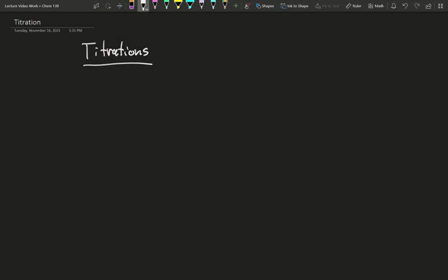In this video, we're going to discuss titrations. Titration is a chemical method of reacting two materials in solution. In general, you'll have one beaker with chemical X in it, and you will have what's called a burette, which is a fairly accurate device for adding liquids. It'll have pretty accurate markings, usually 0.1 milliliters.